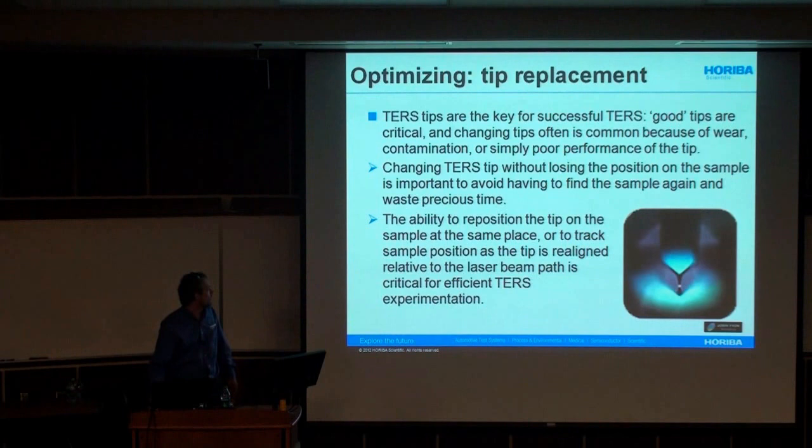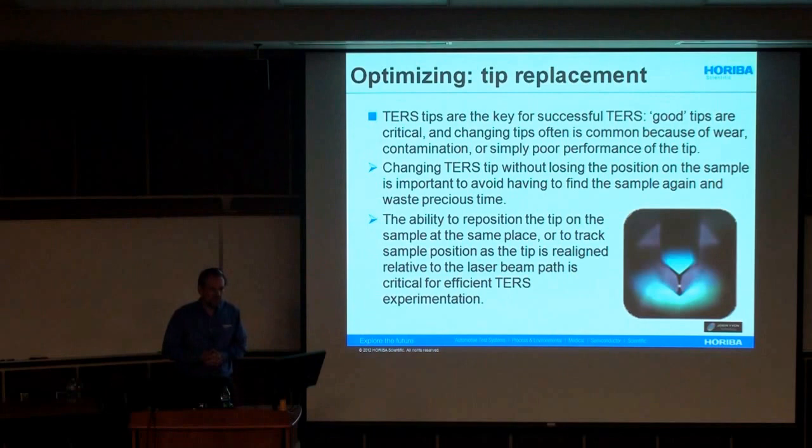So tip replacement, I say it's often overlooked. You know, if you spend time looking and finding a sample and you scan for an hour to find a piece of DNA, then your tip might be worn out by then, and then you don't have any more TERS enhancement. So you spent that hour looking for that piece of DNA, and then you need to change tip, and you're totally at a different place. Well, you have to start over.